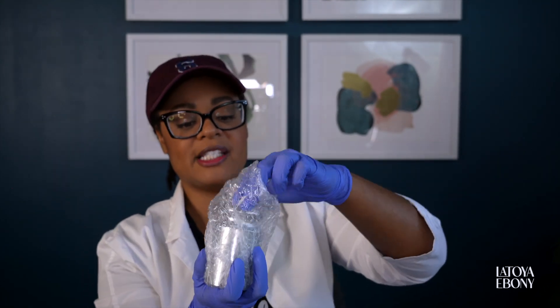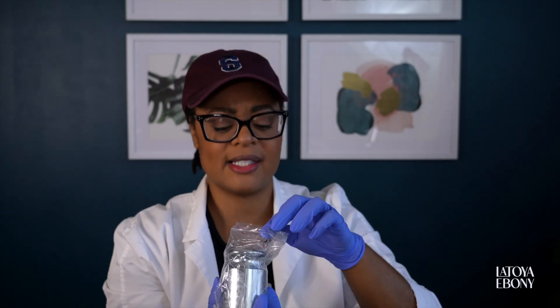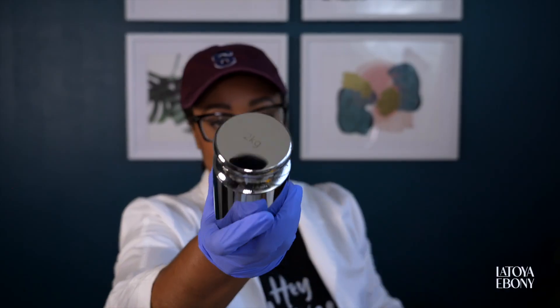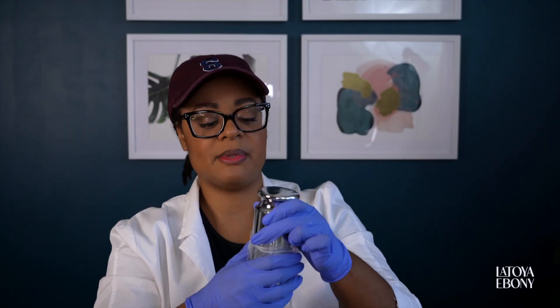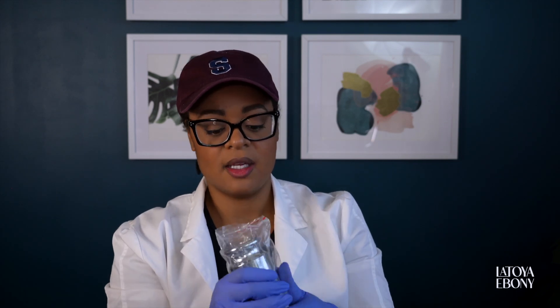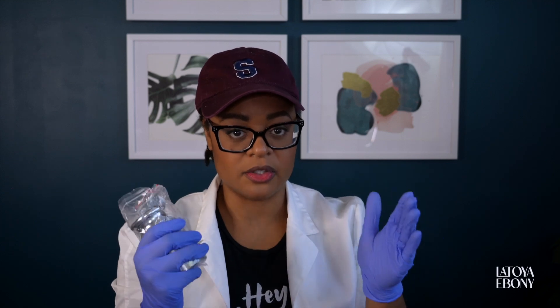They do such a good job of protecting it, this particular brand. I've gotten some calibration weights and this one comes greatly packaged. These need to be well protected because you don't want to alter the weight, since you're literally using this as a baseline for your scale.